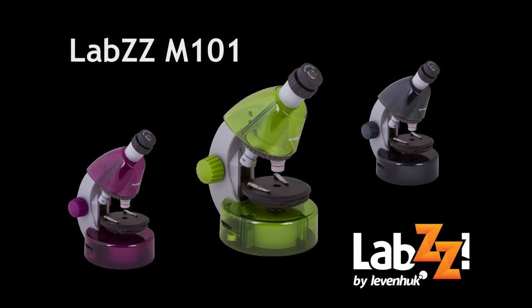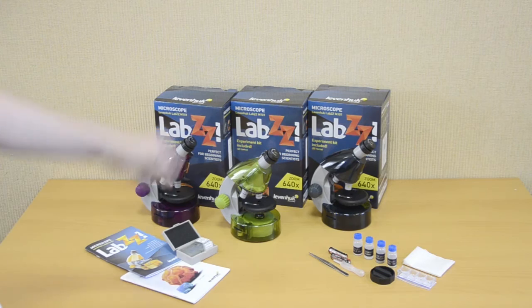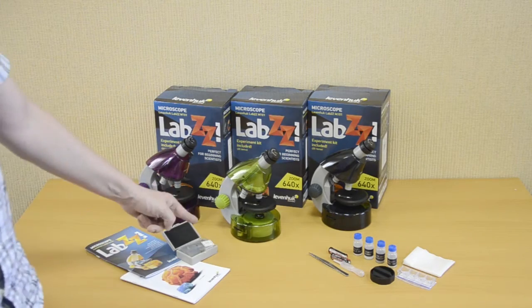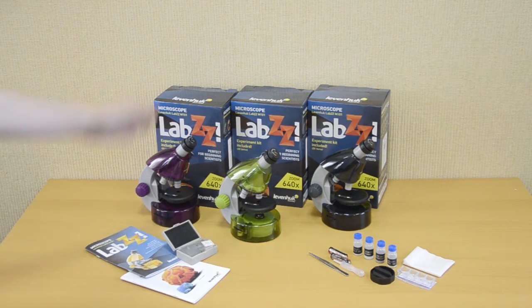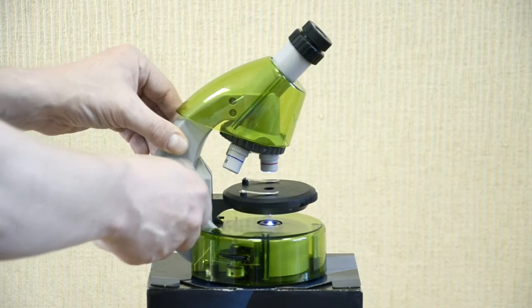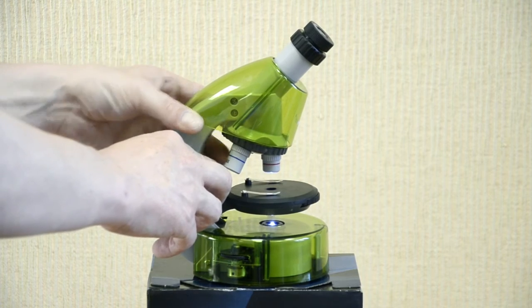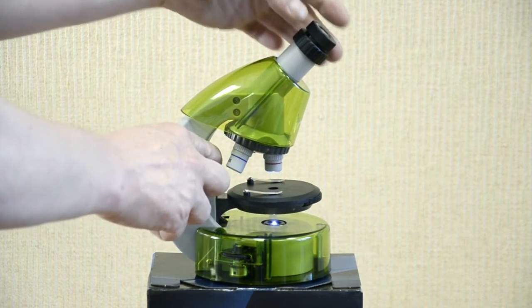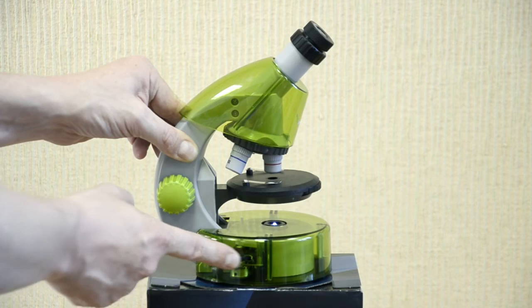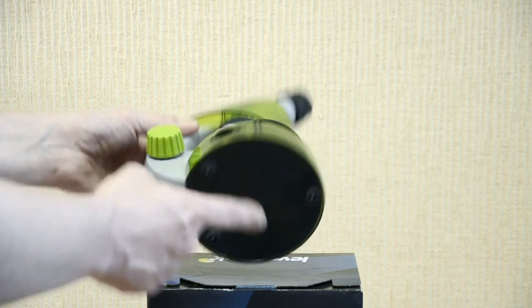For young microcosm explorers, we recommend the Levenhuk Labs M101 microscopes with high-quality optics, magnification from 40X to 640X, and uniquely shaped plastic bodies. Each one comes with an experiment kit with slides and tools, user guide, and a bright gift box. The image sharpness is easily adjusted with the focusing wheel, moving the stage up or down. The revolving nosepiece holds three objectives and the stage has slide holders. The model features a unique sliding two-position eyepiece — 10X and 16X. The lower LED illumination with adjustable brightness allows observing transparent objects. The microscope is powered by standard AA batteries included in the kit.